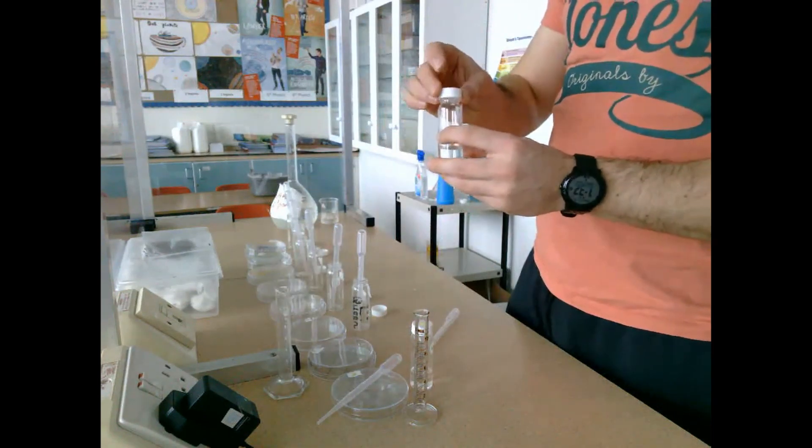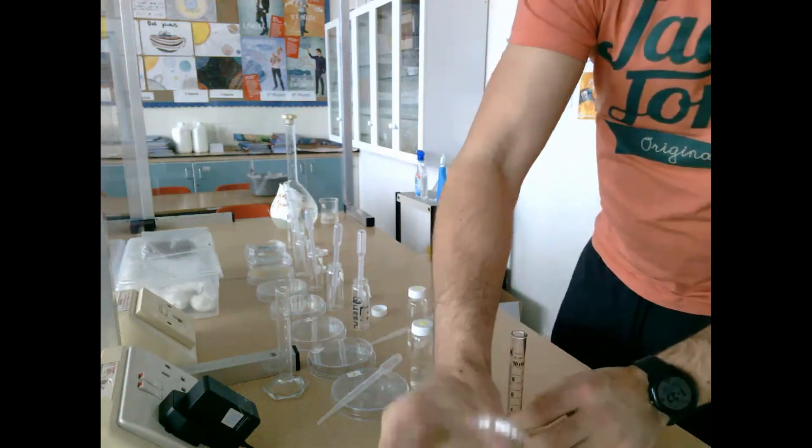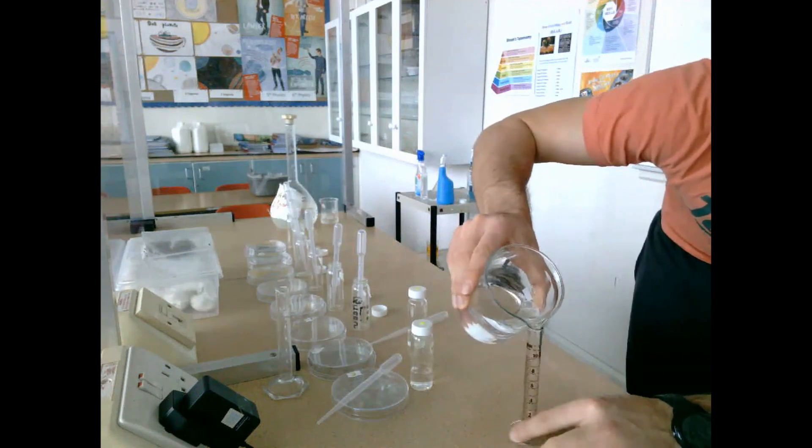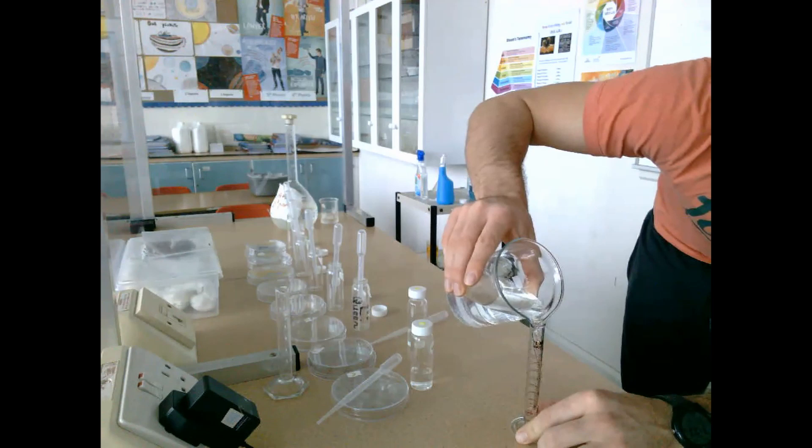Once we have glass jar one done, we can carry out a serial dilution. We measure out another nine milliliters of water and add it to glass jar number two.